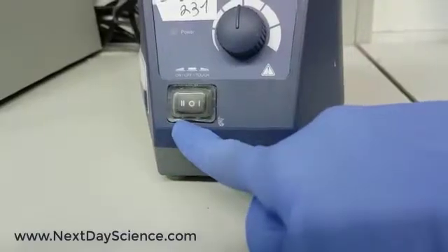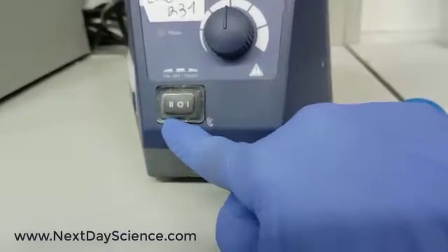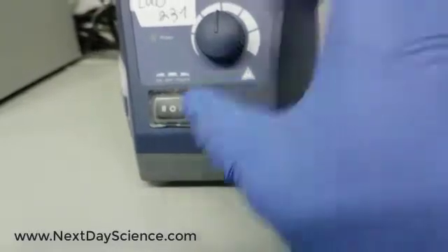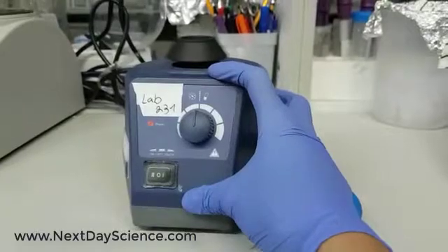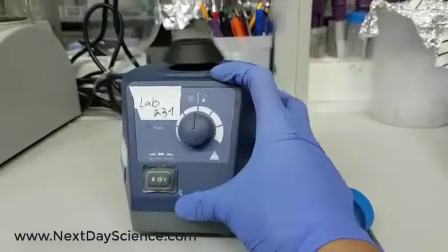We have this button with three modes: on, off, and touch mode. Let's do one click on 'on' — now the Vortex is on. One click on 'off'.